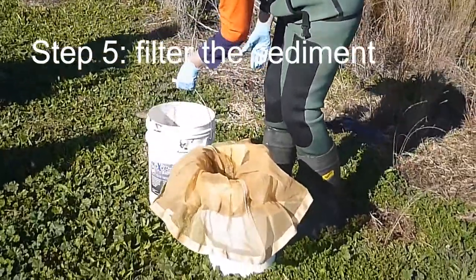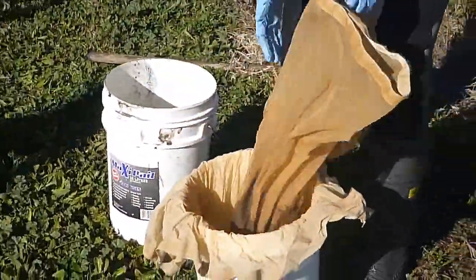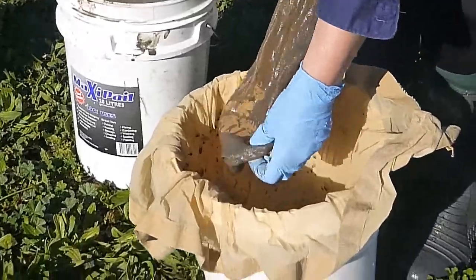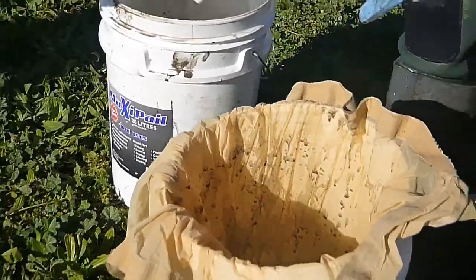Then you pour the sediment and water into the nets for filtering. First of all we filter through the coarse net. The one we have here is a 500 micron net, and this will retain things like leaves and twigs so that they don't pierce the finer net.